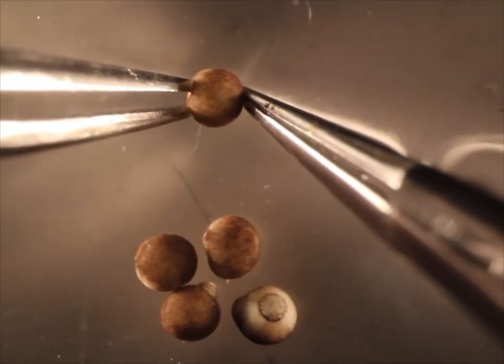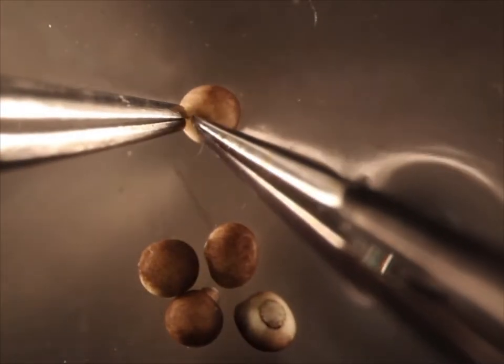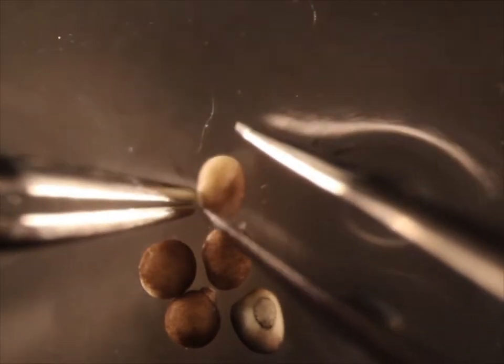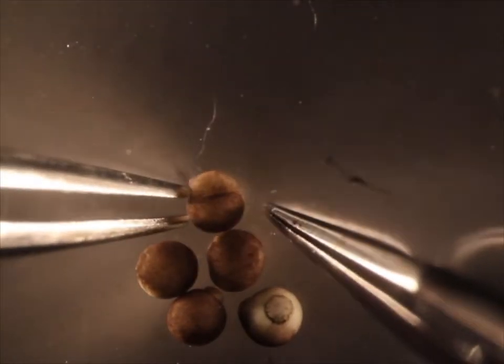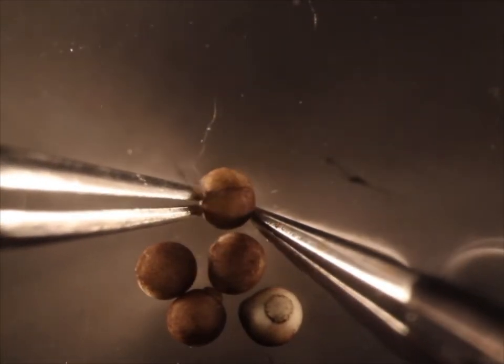The first step in creating animal cap explants is to remove the vitelline membrane, which is a clear protective barrier around the embryo. This has been completed prior to today's lab.